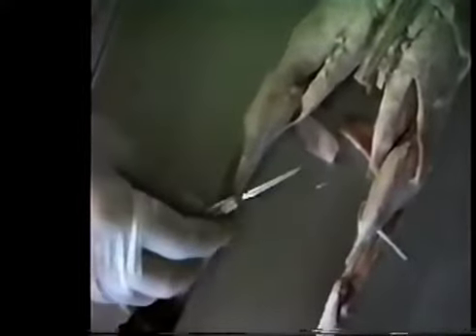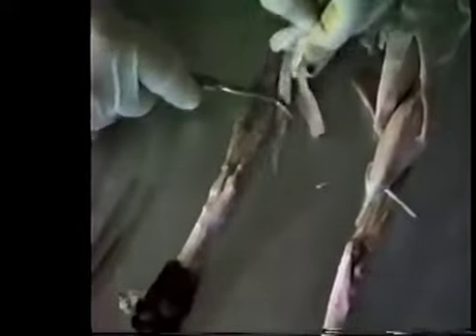Now we're going to move down to the very lowest part of the leg, down below the knee. This first big muscle below the knee is the gastrocnemius muscle. It's going to be sort of cup-shaped on the underside. Here's the gastrocnemius muscle. The very next muscle under that is the soleus muscle, and then the plantaris muscle.